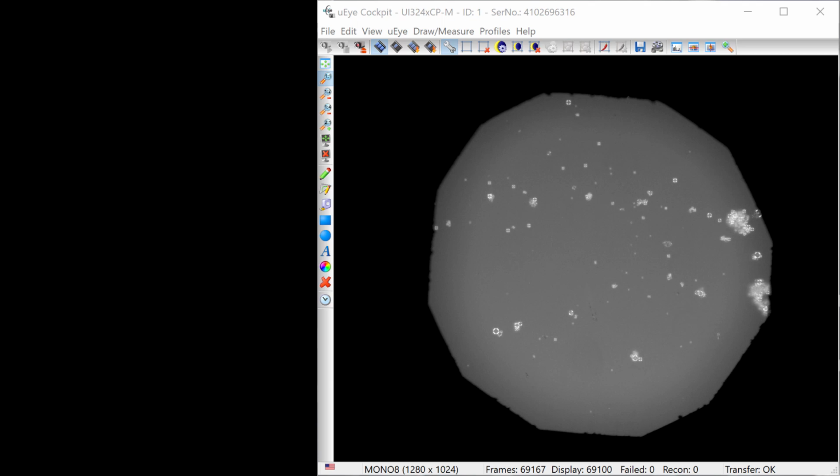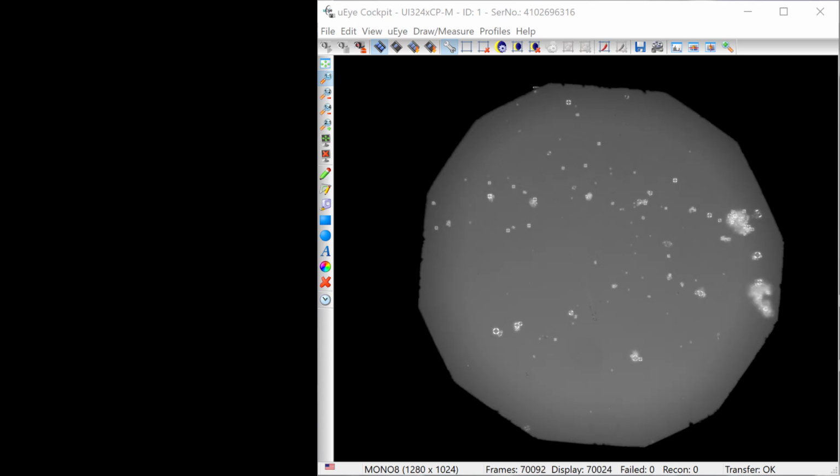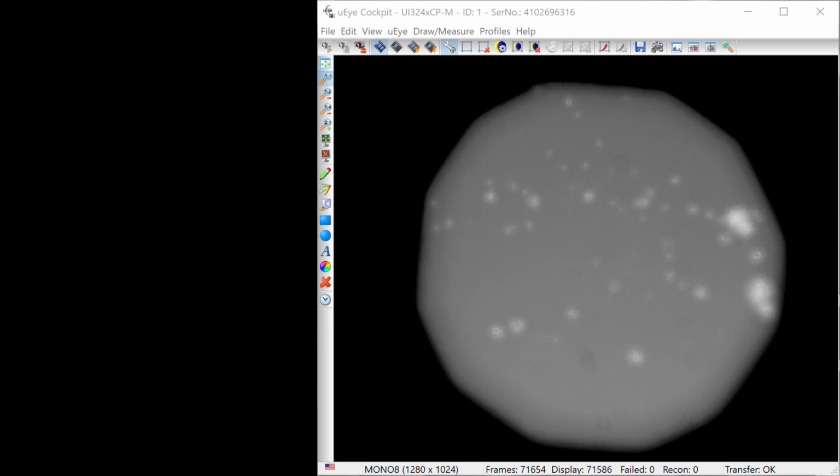We usually can center the field stop, but its position along the optical axis is fixed, unlike the position of the condenser that we need to adjust properly in transmitted light imaging. Closing the A stop too far reduces the amount of light that illuminates our specimen. Generally, the optimal opening of the A stop should ensure that we are utilizing the full numerical aperture of the objective. Now I'm focusing downwards, moving the objective away from the specimen plane.